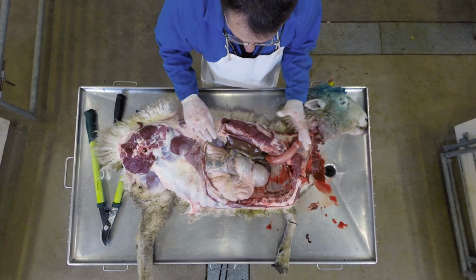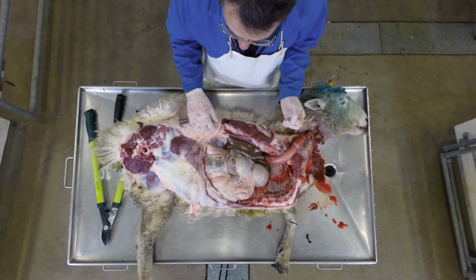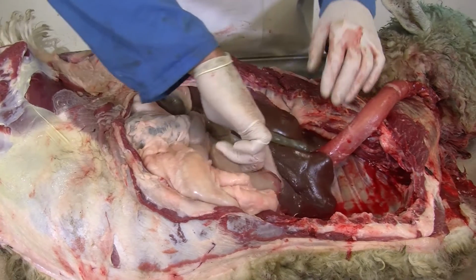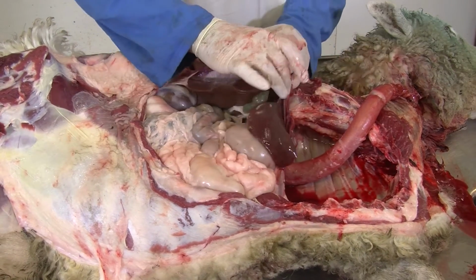So what I'm going to do now is to start removing these organs and just have a little bit of a closer look at them. So what we'll do is we'll start with the liver.